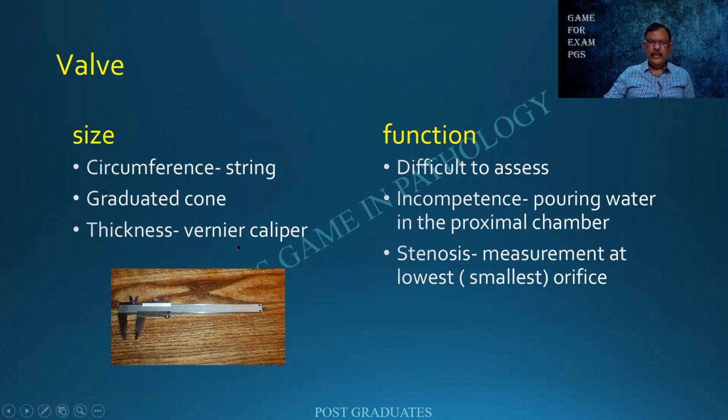And the thickness of the valve leaflet can be measured by means of a vernier caliper. This, of course, is my own innovation. Because sometimes they say there is a thickening of the valve. How do you say that the valve is thickened? How do you measure it? Probably we can use a vernier caliper.